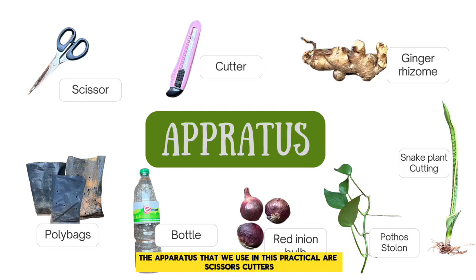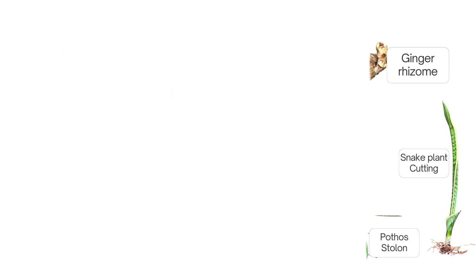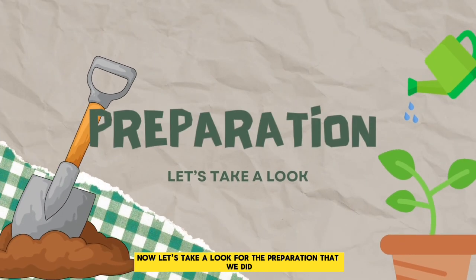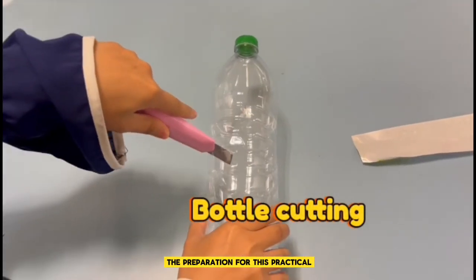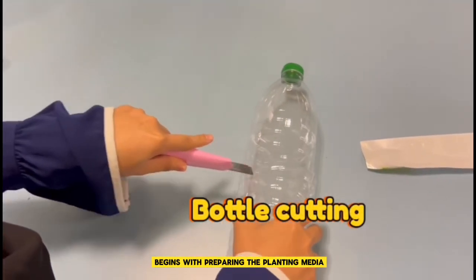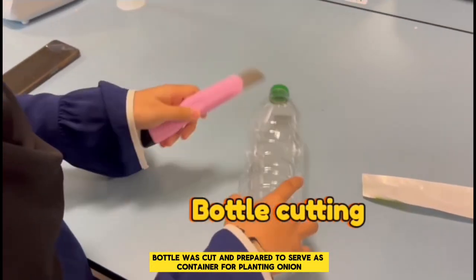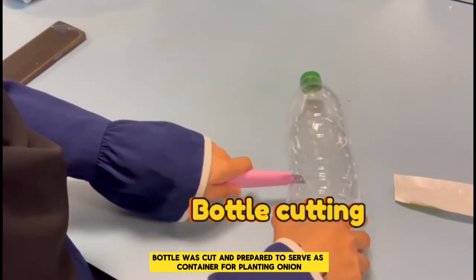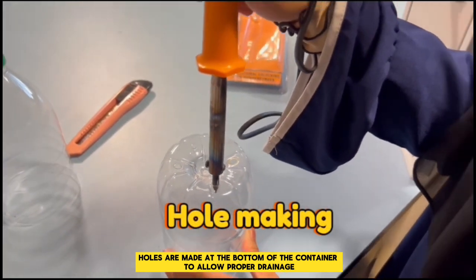The apparatus that we use in this practical are scissors, cutters, polybags, and a bottle. Now, let's take a look at the preparation that we did. The preparation for this practical begins with preparing the planting media. First, a bottle was cut and prepared to serve as a container for planting the onion bulb. Next, holes are made at the bottom of the container to allow proper drainage.